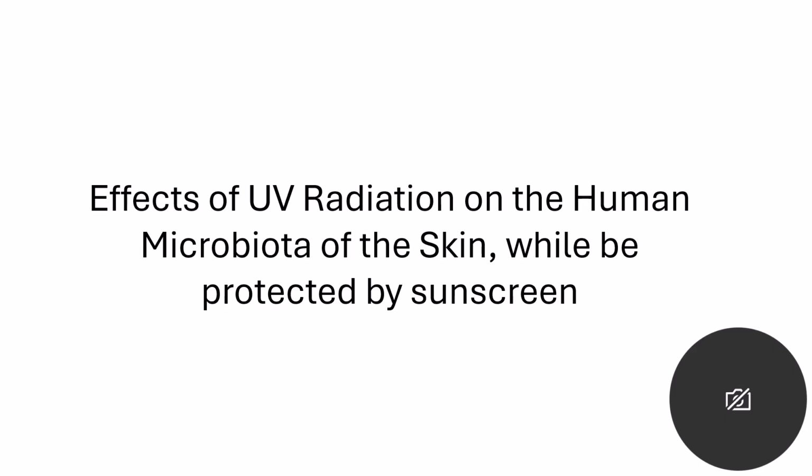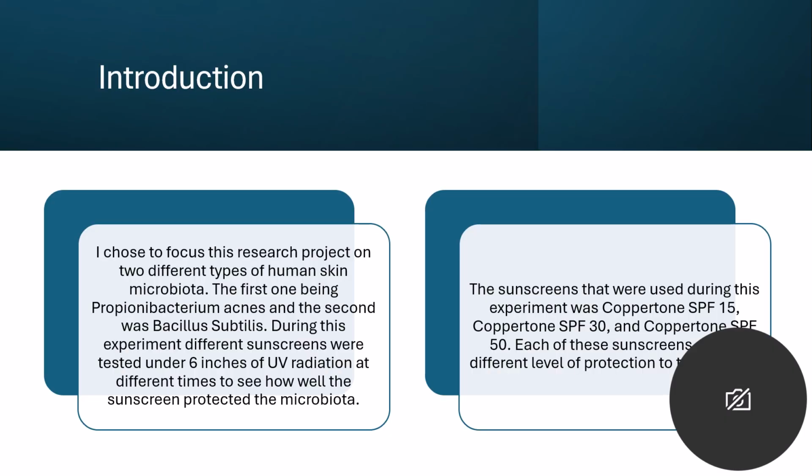So, my research project was on the effects that UV radiation has on the normal human microbiota of the skin while being protected by sunscreen. Before getting into the results of this research project, first I want to introduce you guys and let you know all the materials that were being used and everything like that.